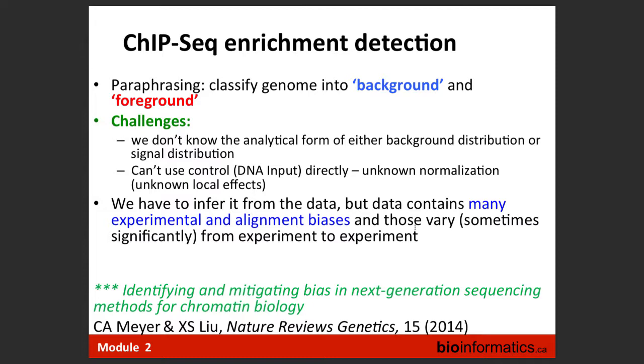If we look at the SNP, at the whole genome shotgun, we have reads aligned. We have a stack of reads aligned. And in some position, we have C in the reference genome, and we just look at what happens in our reads? C, C, and then we have A, C, and then maybe another A. And then we just count. And if we see we have 90 reads stacking in this location, and out of 90, 55 are C and 35 are A, although it's not 50%, it's close enough. There is some statistical model, and we can rather simply infer that there is probably a heterozygous SNP there.